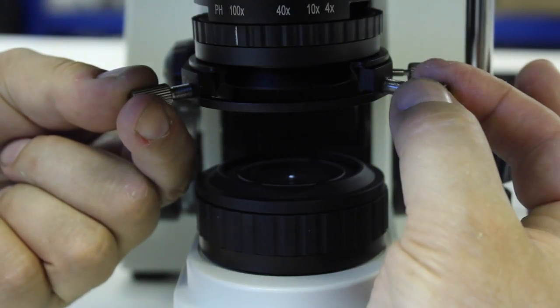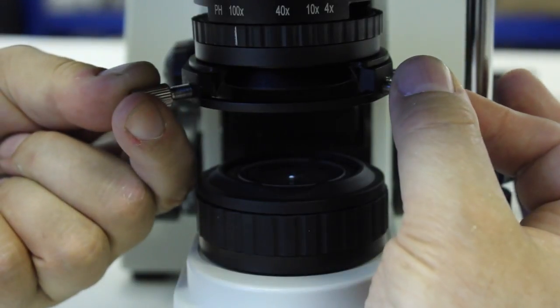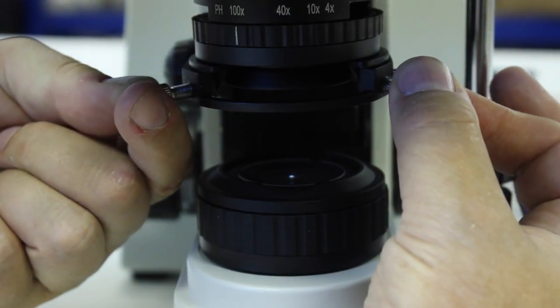We can see this closed iris diaphragm bright spot down the microscope, and these two controls either side of the condenser assembly move the condenser laterally in either direction. The idea is to move the center spot until it's right in the center of the field of view, and when it's right in the center, just stop.